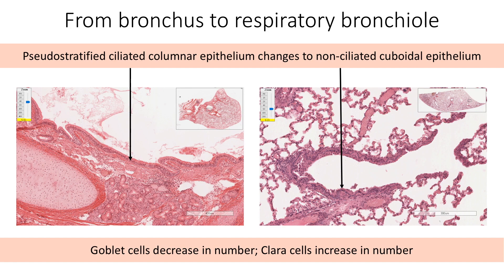From bronchus to respiratory bronchioles, the pseudostratified ciliated columnar epithelium changes to non-ciliated cuboidal epithelium. The number of goblet cells decreases, and the number of Clara cells increases as we come towards the bronchiole.